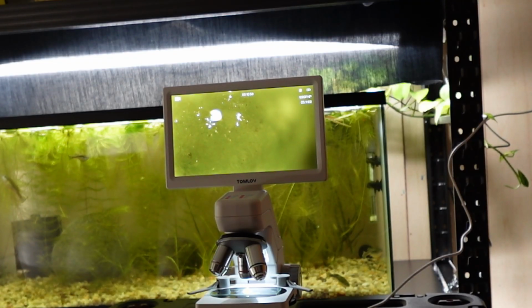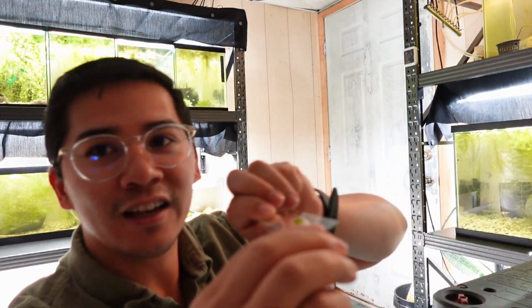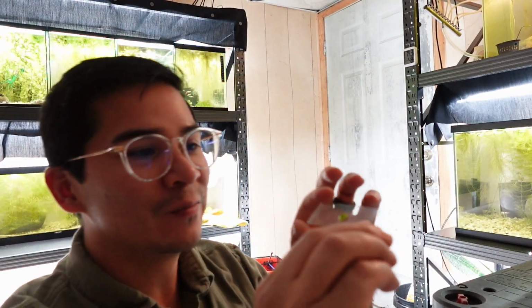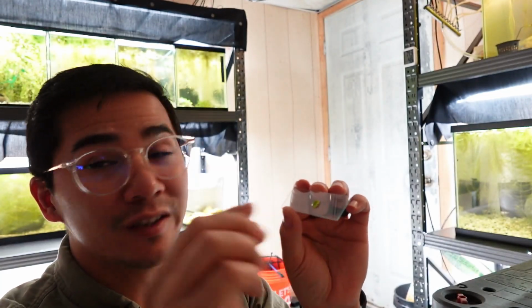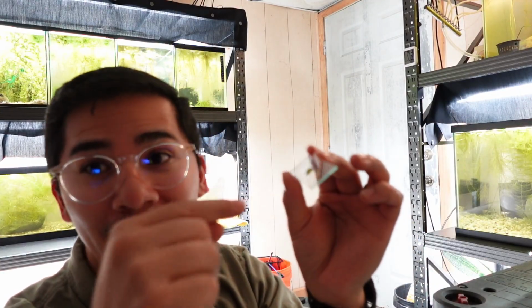What do you guys guess this is? If you guess algae, you're 100% right. This is, oh, I'm really zoomed in. Let me zoom out a little bit. That was hair algae from one of my fish tanks. As you can see here, just a little blob of algae. So if you guessed algae, you're 100% right. And guys, this is a tiny bit of algae, and we saw life in there already. We saw a few things moving around. So in this tiny droplet of algae, there's somehow life in here, which is incredibly interesting.